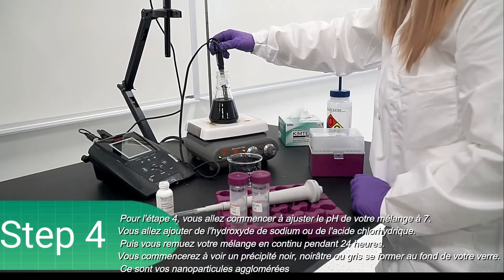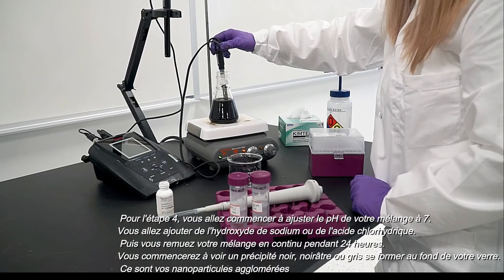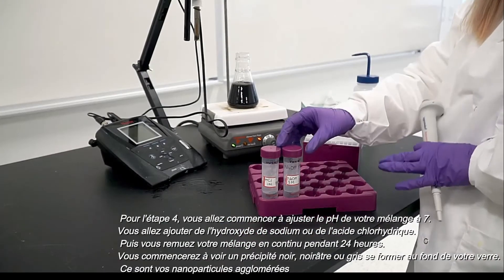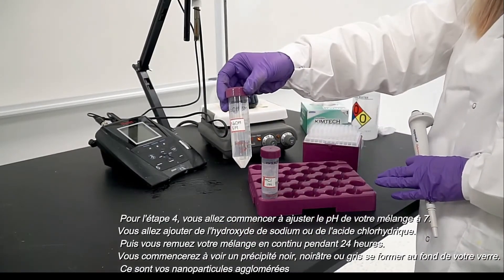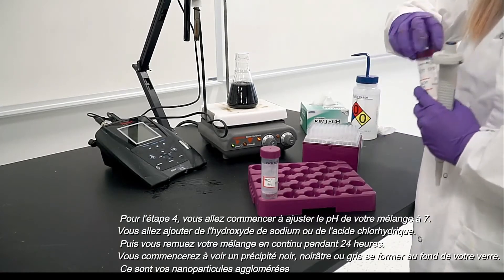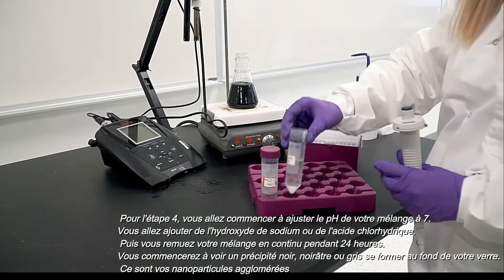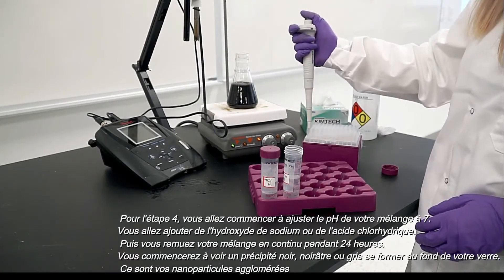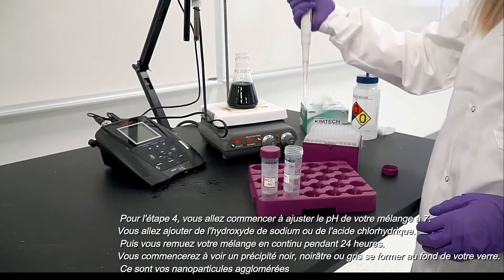Step four: you will begin by adjusting the pH of your mixture to seven. You will dropwise add sodium hydroxide or hydrochloric acid. Then you will stir your mixture continuously for 24 hours. You will begin to see black, blackish, or gray precipitates forming at the bottom of your glassware. These are your clustered nanoparticles.